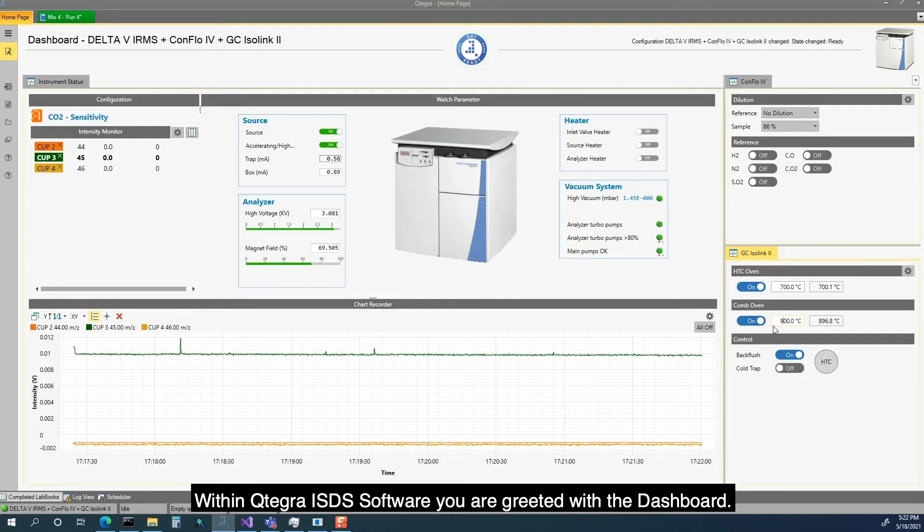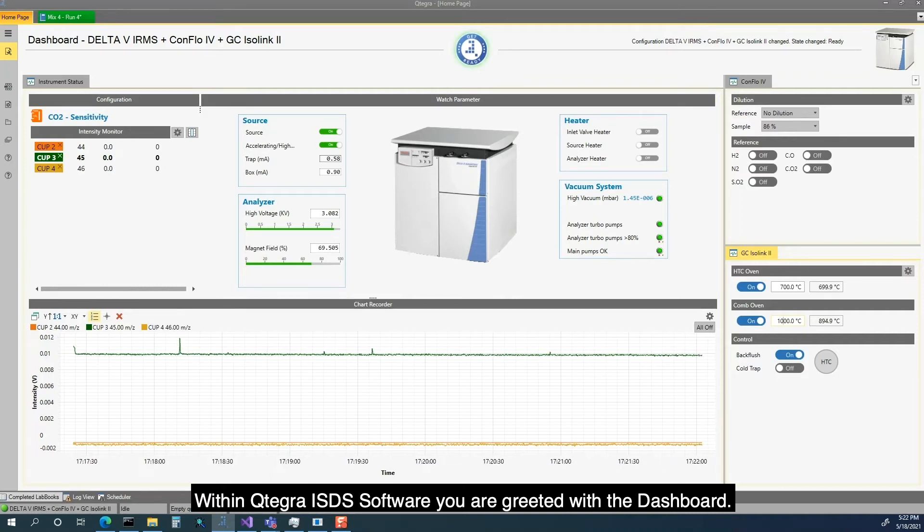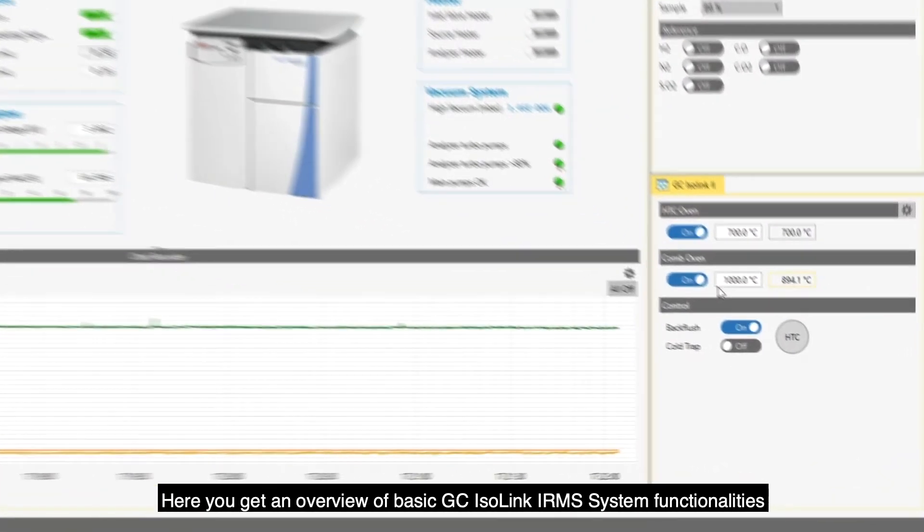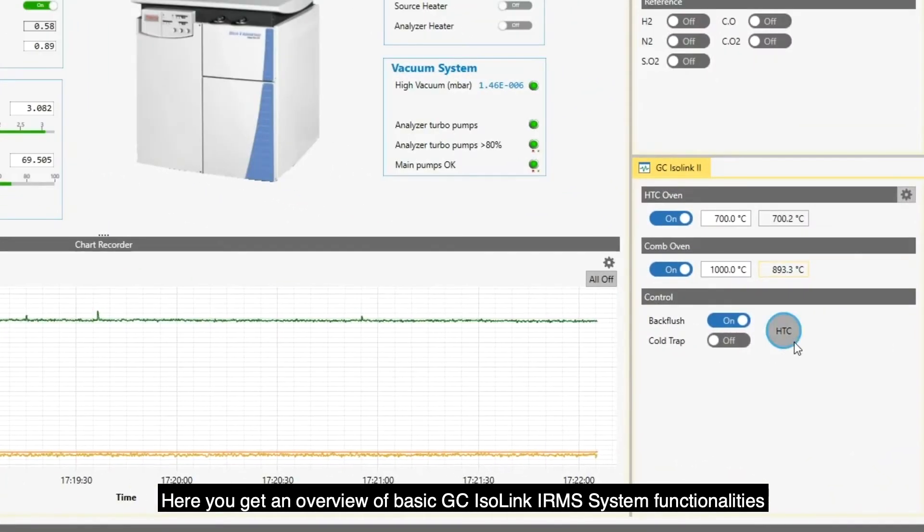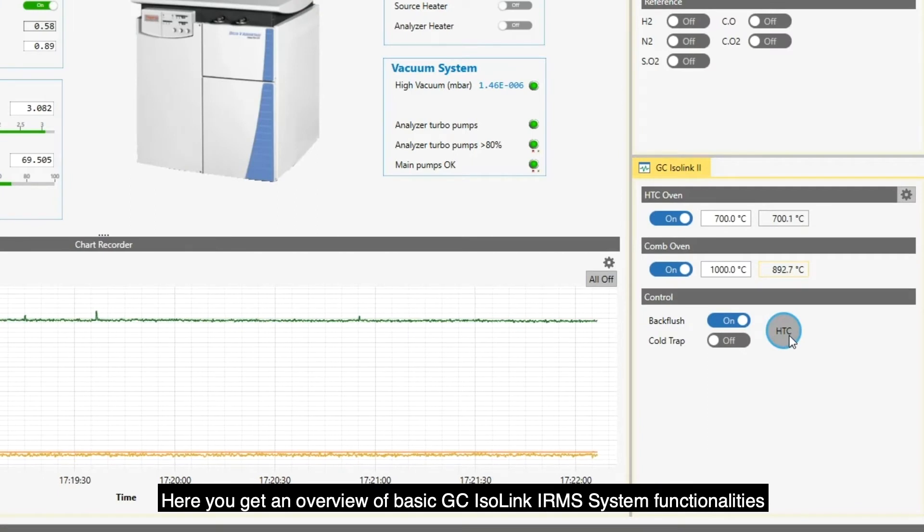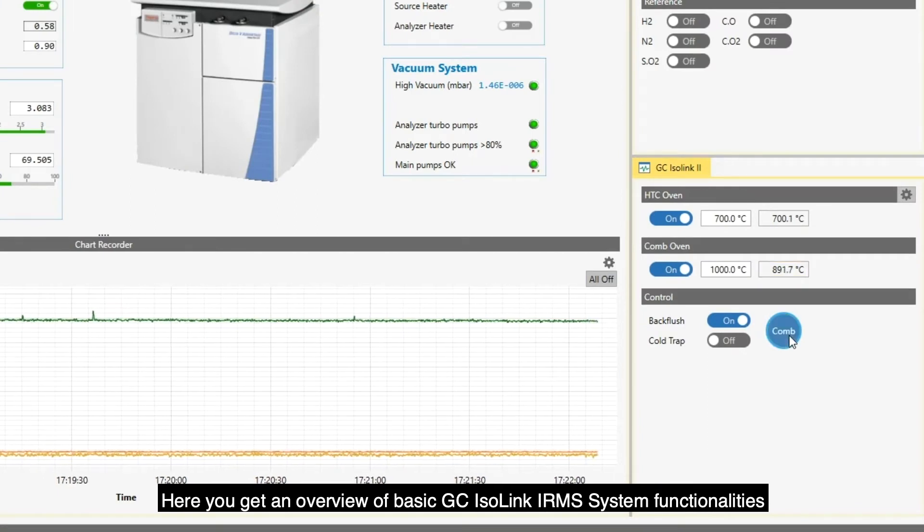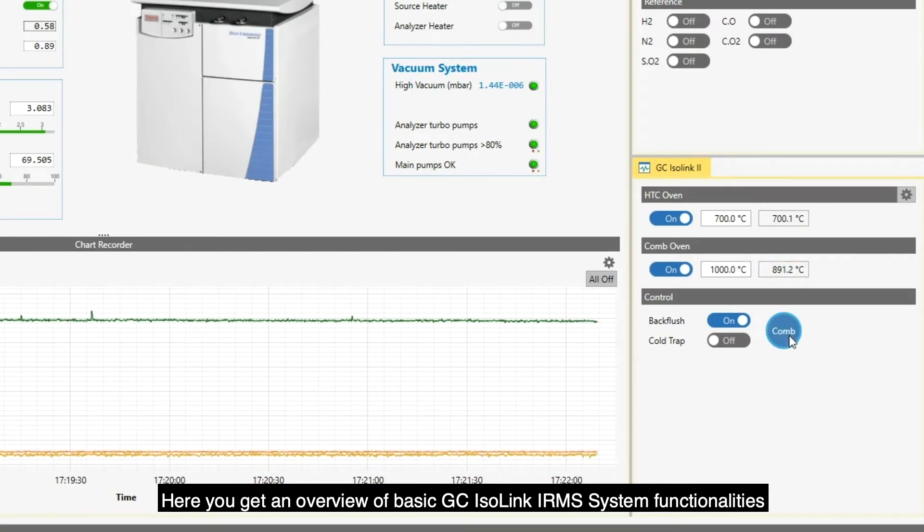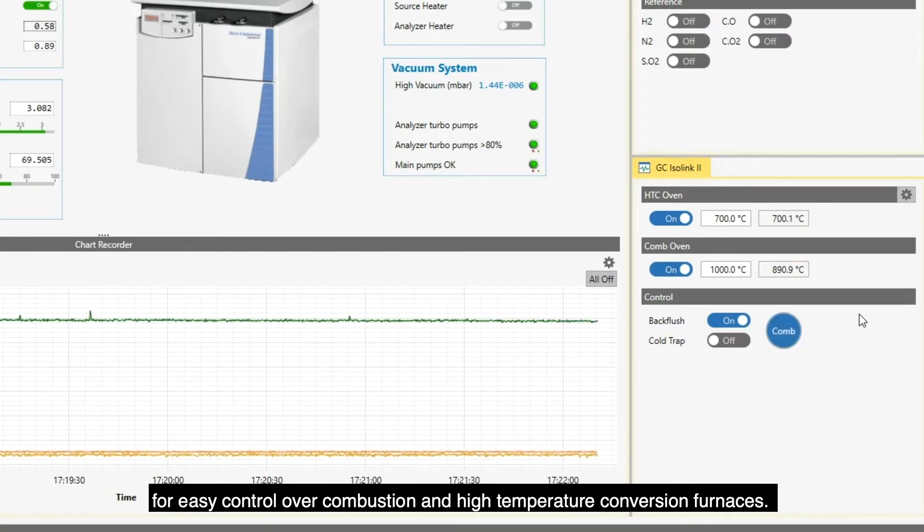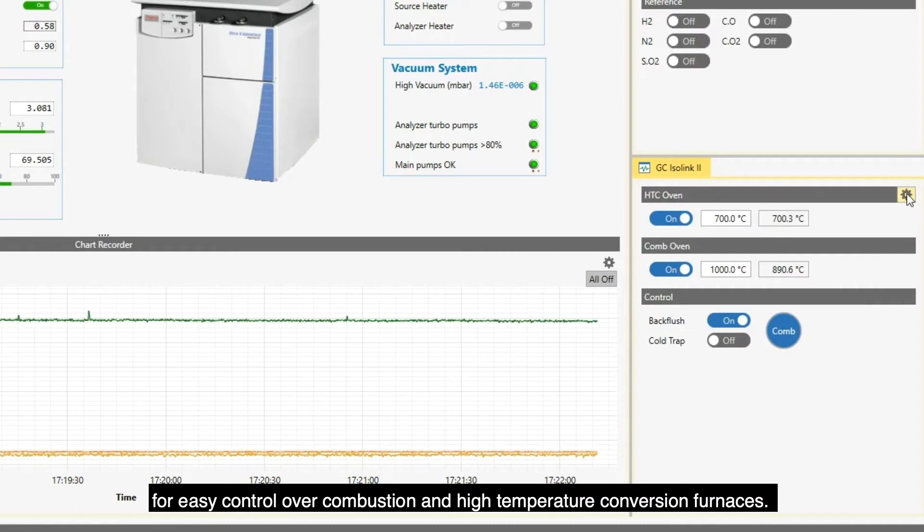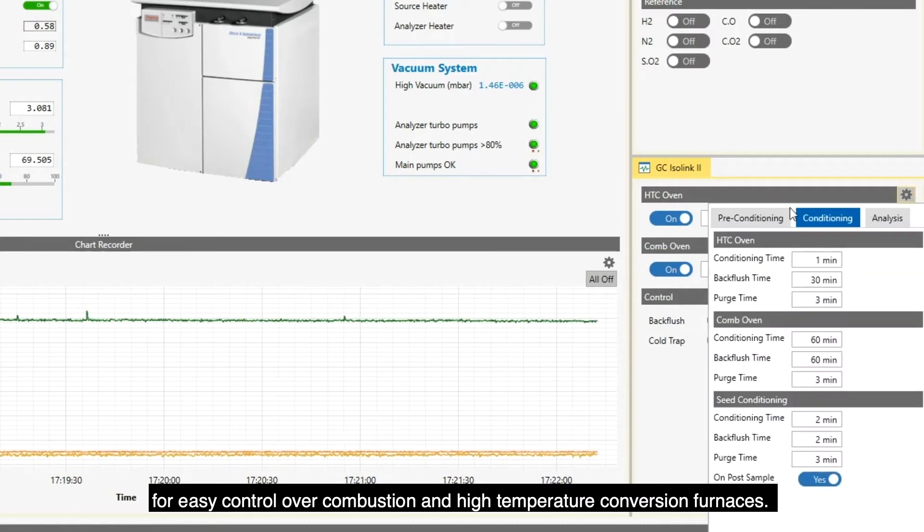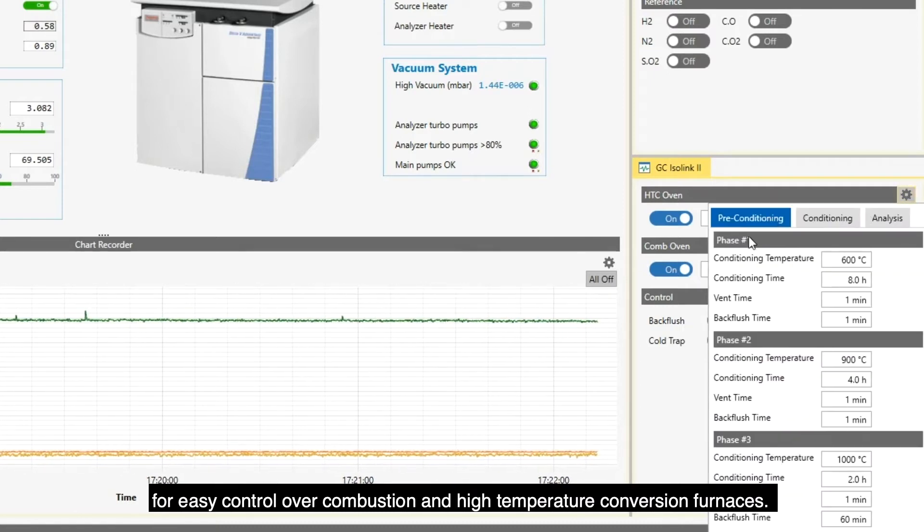Within Cutegra ISDS Software, you are greeted with a dashboard. Here you get an overview of basic GC Isolink IRMS system functionalities for easy control over combustion and high-temperature conversion furnaces.